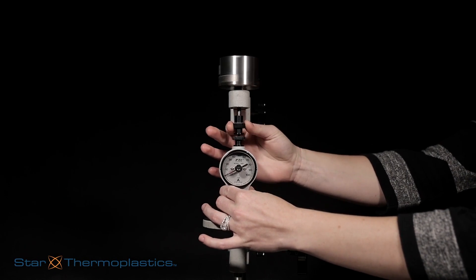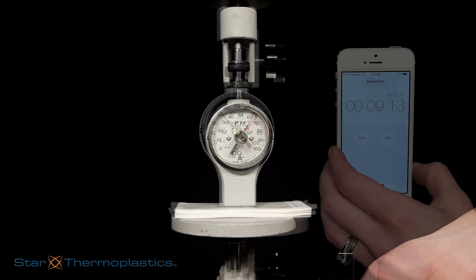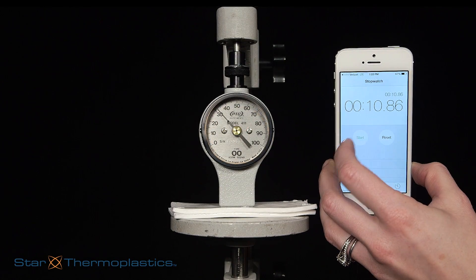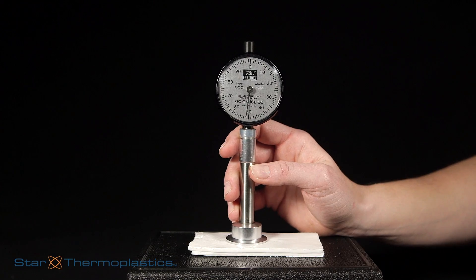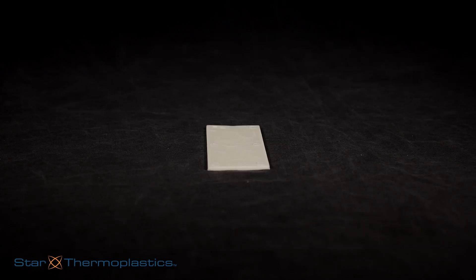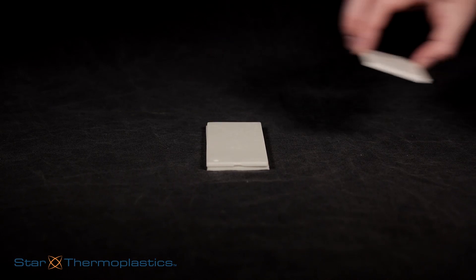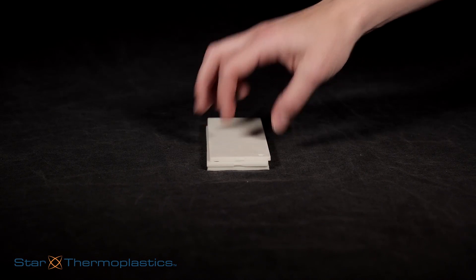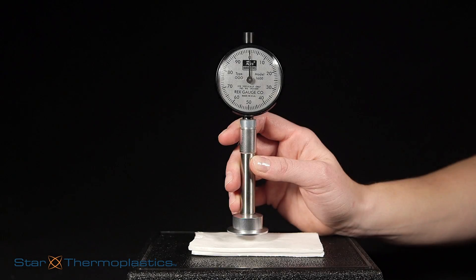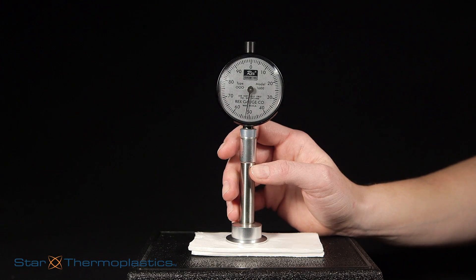We're going to show you a typical testing method for thermoplastic elastomers. We can take an instant hardness or a 10-second hardness, done with either a handheld or a stand durometer. In compliance with the testing method, the material needs to be at least a quarter of an inch thick and placed on a smooth surface. If the material is not thick enough, it can be doubled or tripled to achieve the necessary thickness.